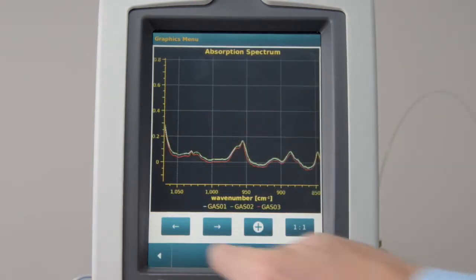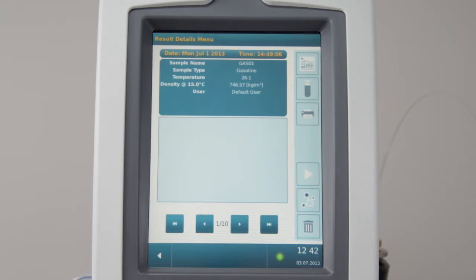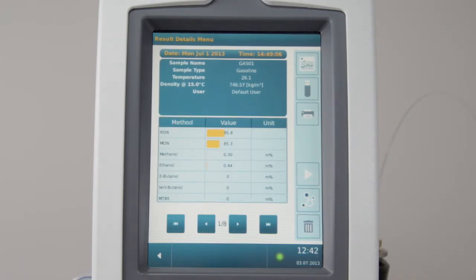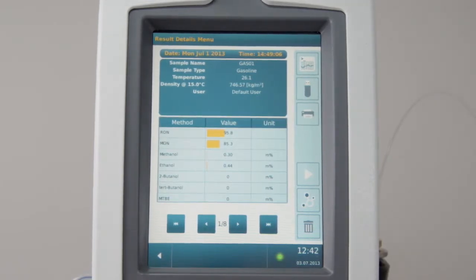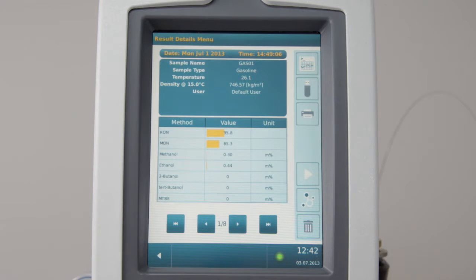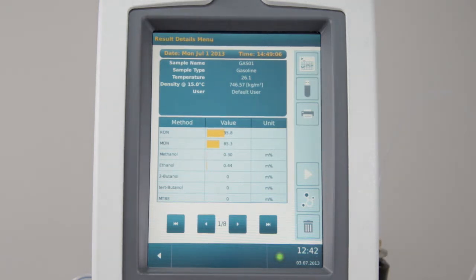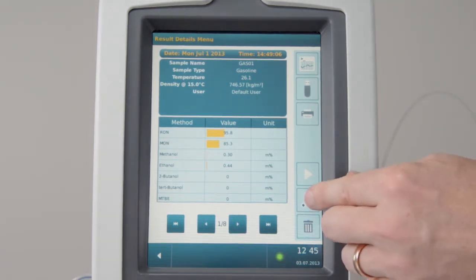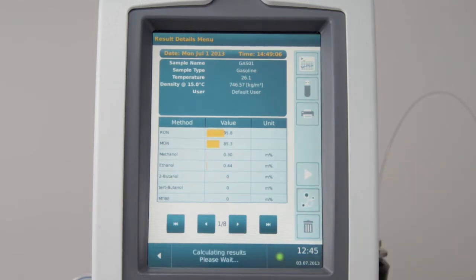Press Back to get back to the result. In this screen, you also find the Recalculate button for later use. If you have calibrated new samples for parameter prediction and want to refresh predicted values, press Recalculate.